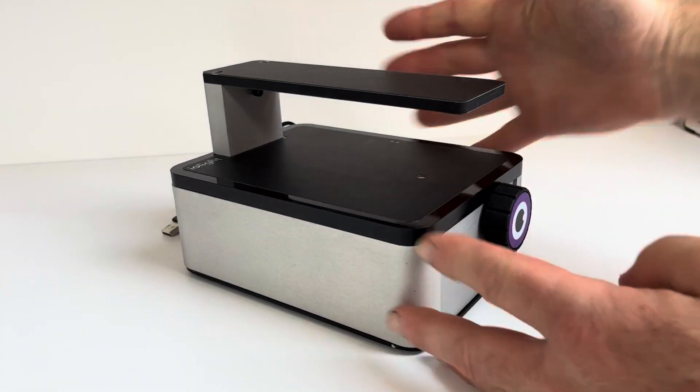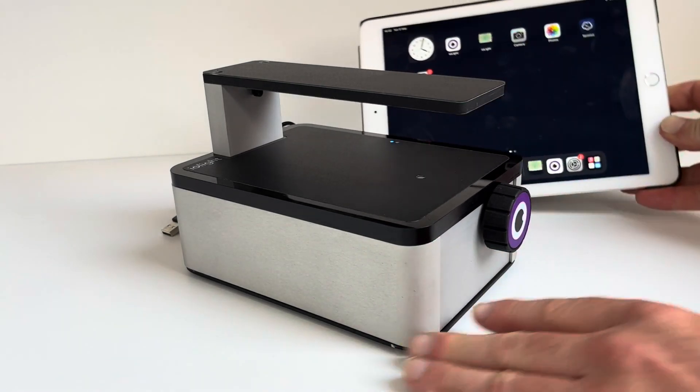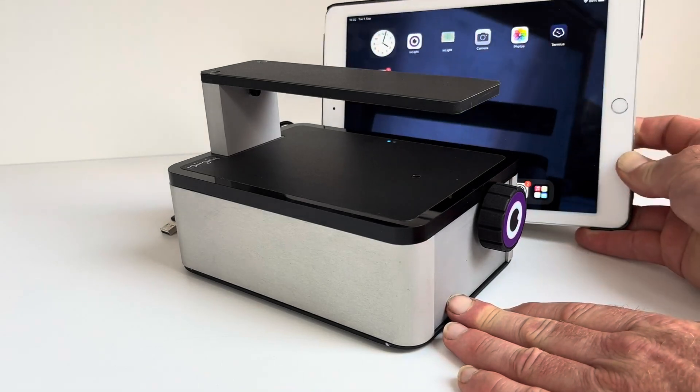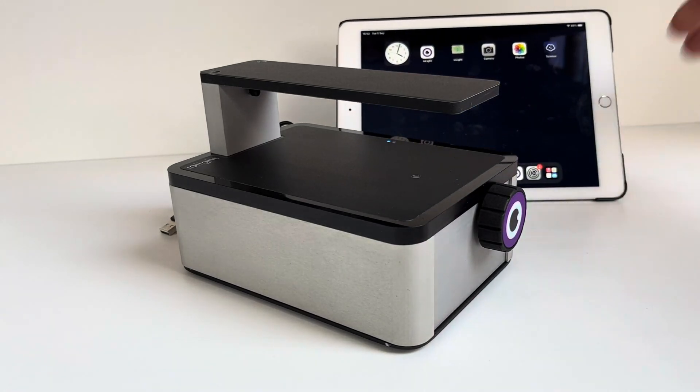You can see the size of the microscope from my hands, and here's an iPad for comparison of size as well. You can see it is significantly smaller than the iPad, so a rather compact little microscope.